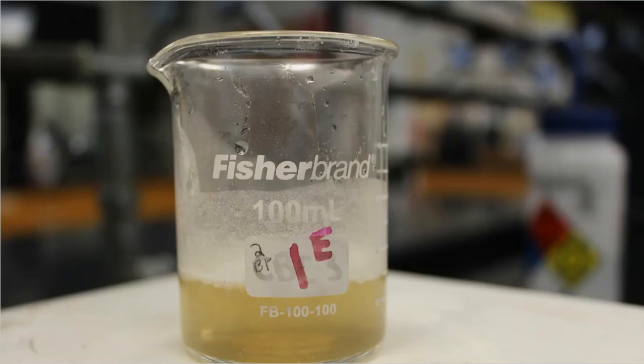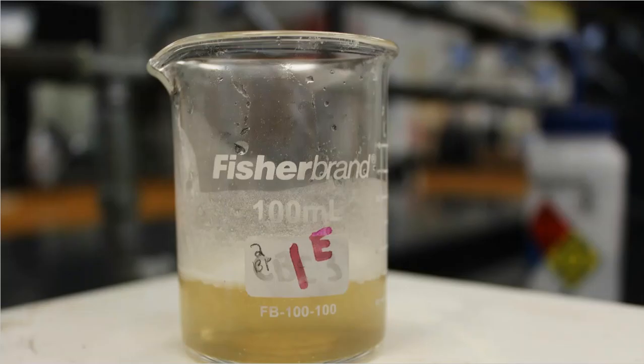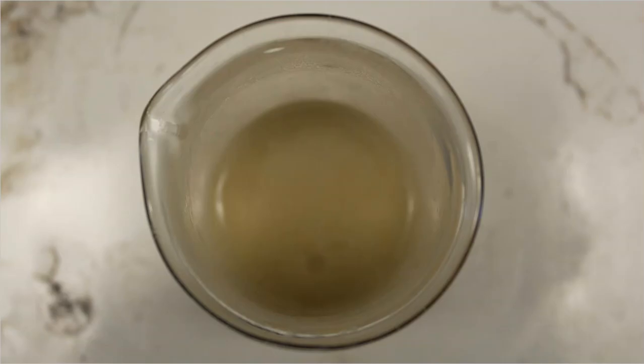And what I saw was a slight clearing up in that solution. You're seeing some maybe crystalline formation happening up on the upper side of the beaker. That's due to me swirling and stirring it. And down below, you can see that it went from something cloudy and milky to something that's beginning to clear up, and I can almost start to see through it at this point. Looking from the top down, this is what I see. Still kind of muddy, still kind of murky, right?